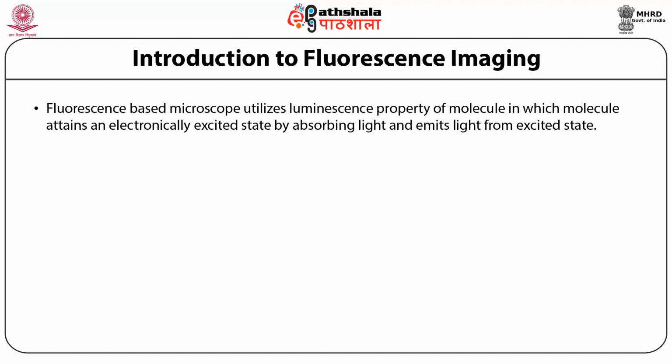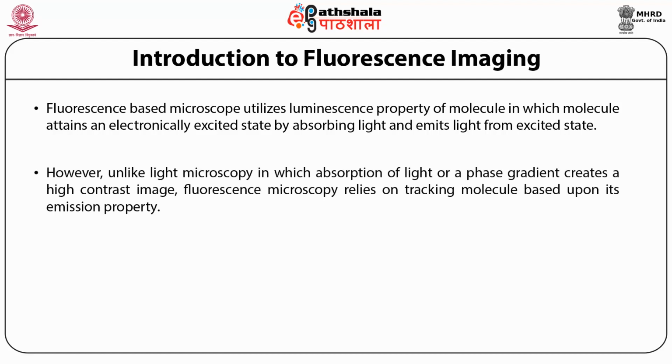Now this property is exploited by the fluorescent microscope, in which we tag our sample with specific luminescent molecules, excite it with a specific wavelength, and look for the signal which we anticipate coming out from the sample. Unlike light microscopy, which relies on absorbing the light that passes through the specimen, here we are looking specifically at the signal or wavelength emitted by the fluorescent molecules.